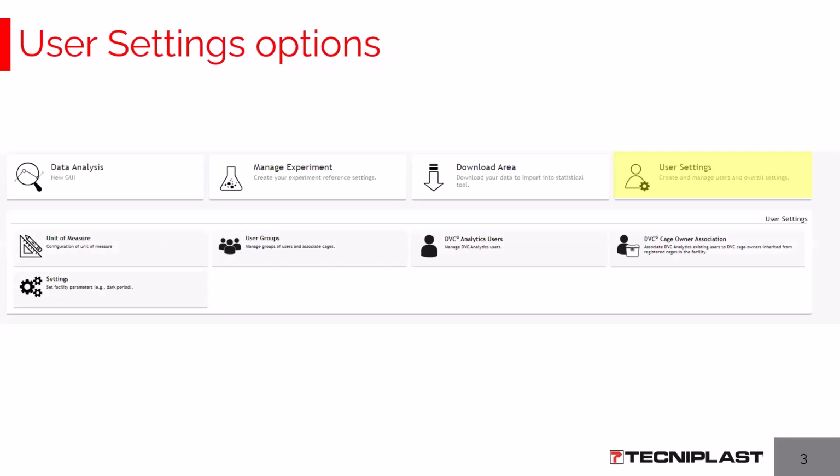What's inside the user setting? You have just seen the content. By clicking the user setting, there is the analytics user invitation, as just shown, and there are other buttons we are now going to cover immediately.